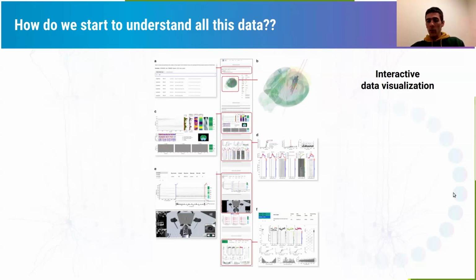This webpage shows a lot of different overview plots of raw data and processed data. I just want to give you some of the highlights. The homework assignment, which I'll talk about more in a few minutes, is going to be going into this website and just playing around, clicking around, seeing what the data look like. The first piece of this website, up at the very top, is the session selector. You can select a particular session. You can search by the lab or the mouse or the date or the regions that a probe passes through. So there are a lot of ways to select an individual probe or session that you're interested in looking at. That's something that I'll have you all play around with.